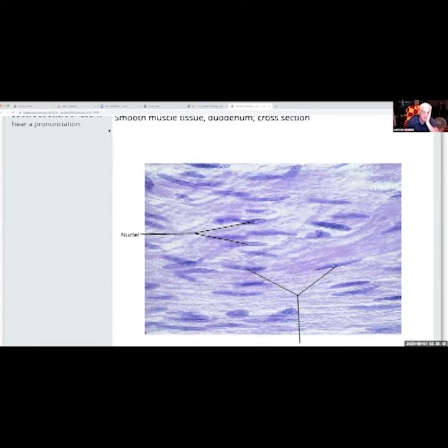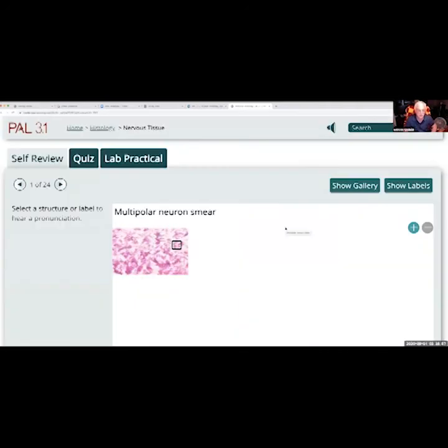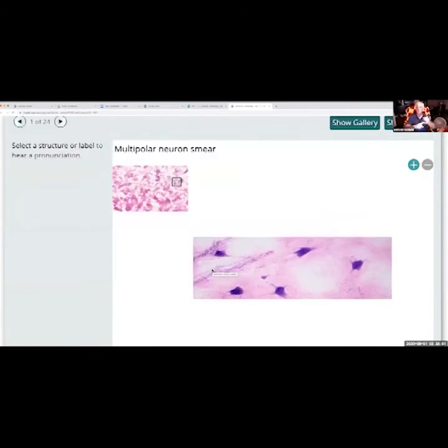All right, perfect. So we did muscle, we did nervous tissue a little bit too. This we didn't do a whole lot of. So let's do at least nervous tissue. All right. Remember we talked about nerve. We talked about the soma. We talked about the nerves have different names. The cell body is the soma. The cytoplasm is called neuroplasm. And you have axons and you have dendrites.